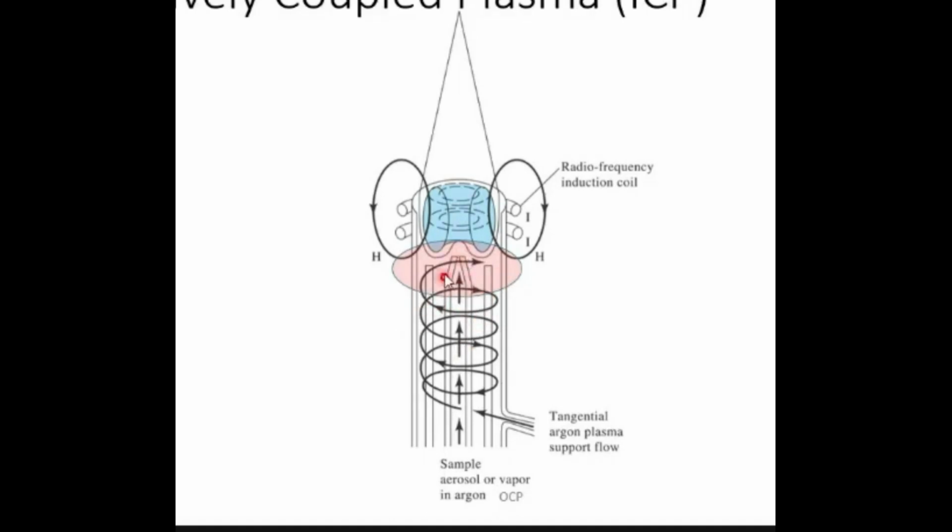It is cooling the quartz. Also, it is used in the ohmic heating in this region. So the tangential argon has two functions here now. It should also be indicated that argon consumption is relatively high, because you require argon as aerosol also, and you require argon for cooling off also. And argon is a little difficult to obtain gas. So because of this large requirement of argon, ICP, that is inductively coupled plasma source, becomes a little bit costly.